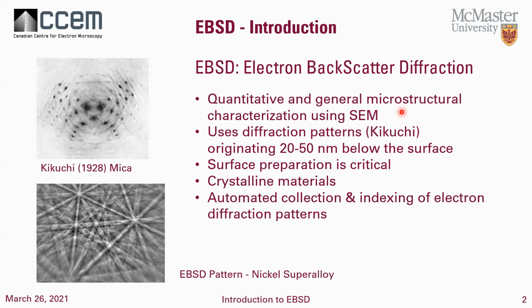So we're using diffraction patterns, which, if we go back to the late 20s, Kikuchi, a Japanese scientist, using a system that produced electrons of high energy, was able to look through a piece of mica, so transmission electron microscopy, and get patterns showing information about the crystal structure. Today we also do both reflected and transmitted EBSD.